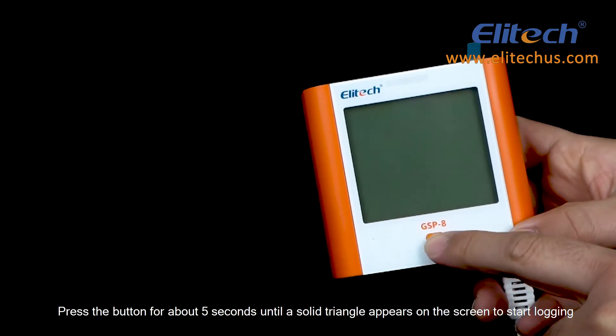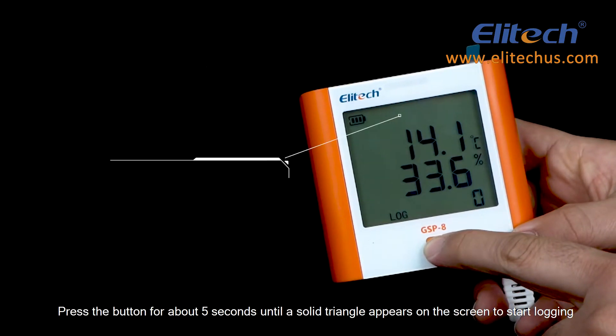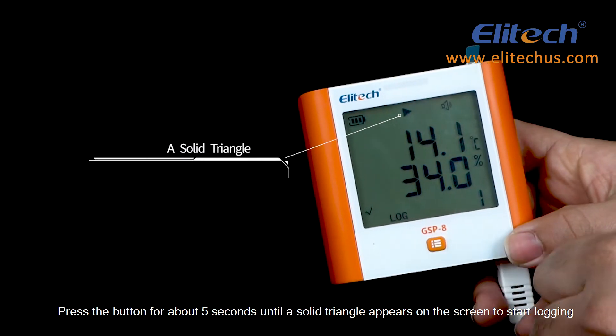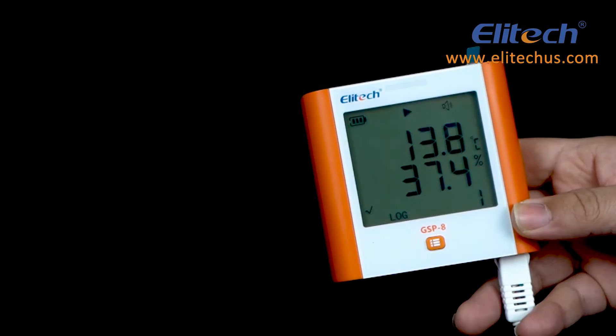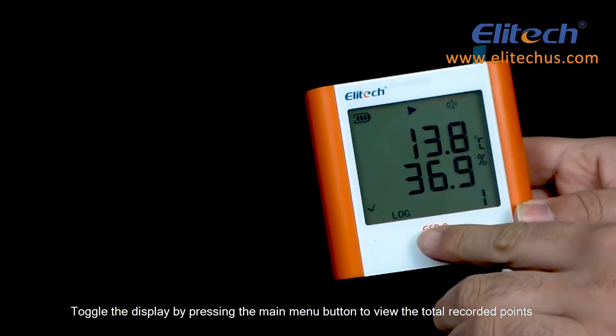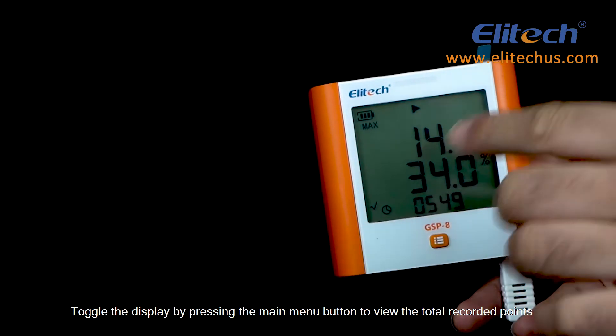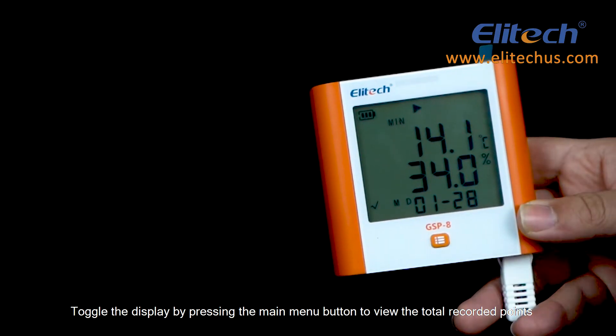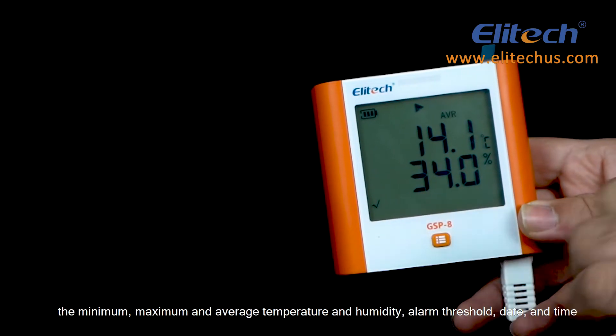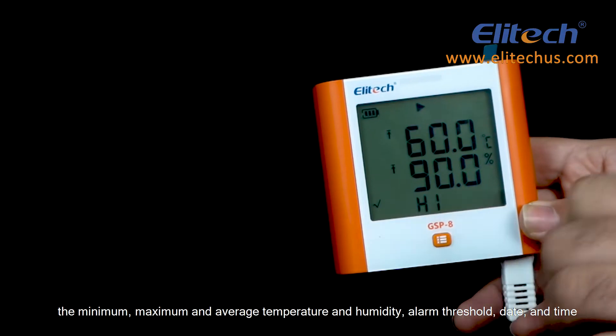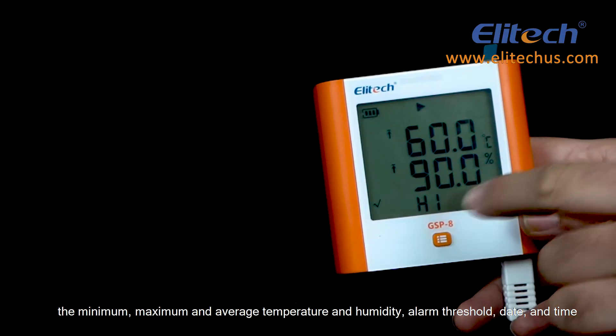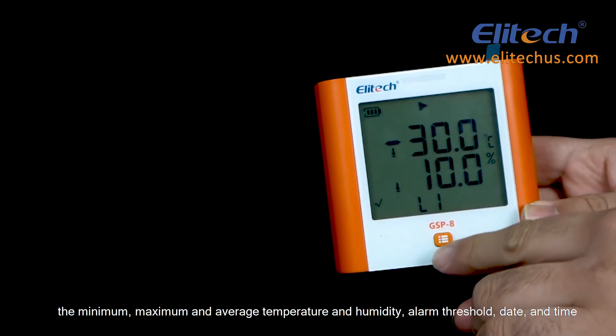Press the button for about 5 seconds until a solid triangle appears on the screen to start logging. Toggle the display by pressing the main menu button to view the total recorded points, the minimum, maximum, and average temperature and humidity, alarm threshold, date and time.